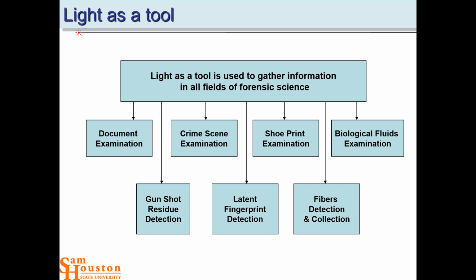Or they spray, like male cats, even if they have been neutered, they'll spray on the curtains, and that smells. You can find that with this light, because those compounds, especially the proteins in those sprays, will definitely fluoresce. Yes.